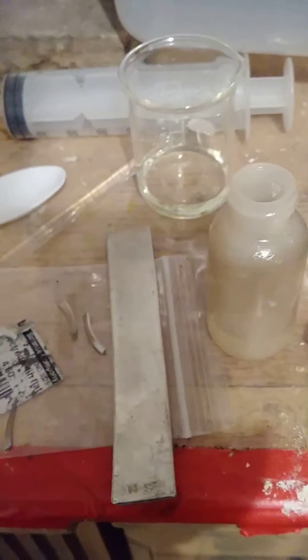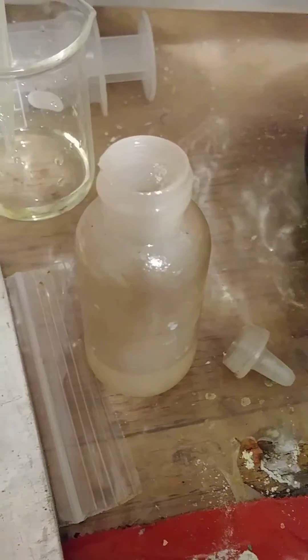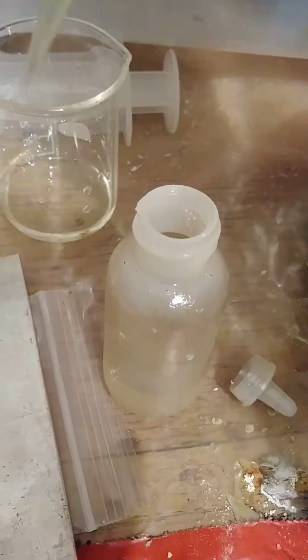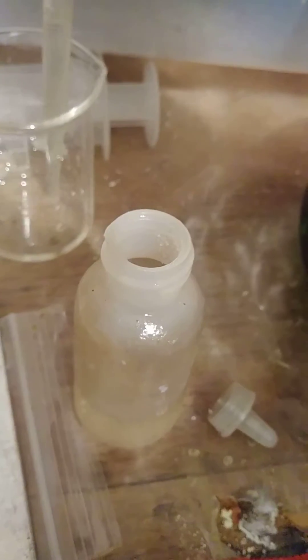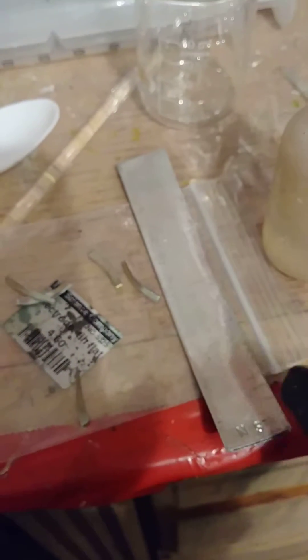My HCl is in here — 31 to 35 percent. I put about 10 to 15 mils. I usually measure it out in my little glass on the line, but I add my HCl directly in.